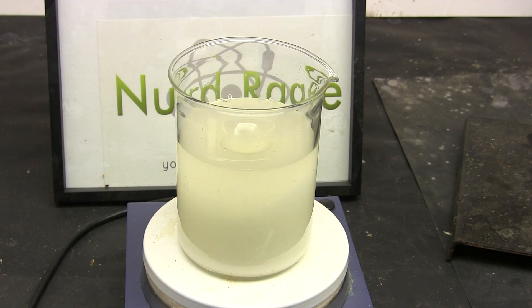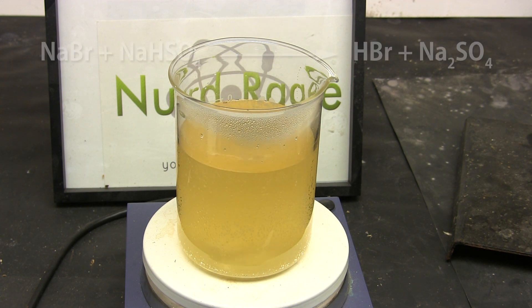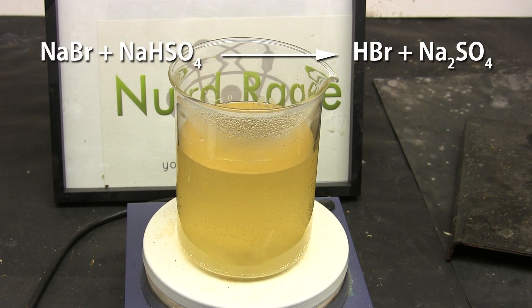Now stir and heat the mixture until everything dissolves. There might be a tiny bit of lingering cloudiness, but as long as all of the granules of sodium bisulfate are dissolved, this is fine. Now turn off the heating and let the mixture cool to room temperature. What we're doing here is reacting the sodium bromide with sodium bisulfate to produce hydrobromic acid and sodium sulfate.